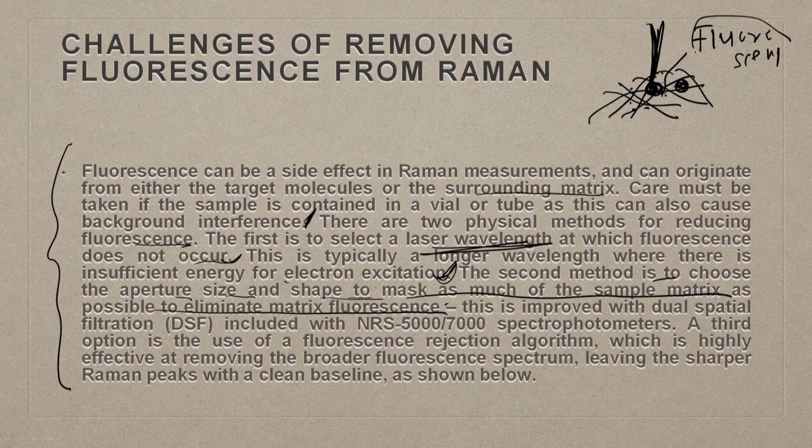And this background fluorescence is very common. I have observed people who worked on hydrogels and cryogels have an inherent autofluorescence, and it's a big challenge for those researchers to get rid of that autofluorescence. You cannot get rid of it so easily. So the only way you can do it is to focus the laser so much on the exact biological sample, and of course then you have to do it very fast. You cannot prolong it, eventually the sample will get damaged.